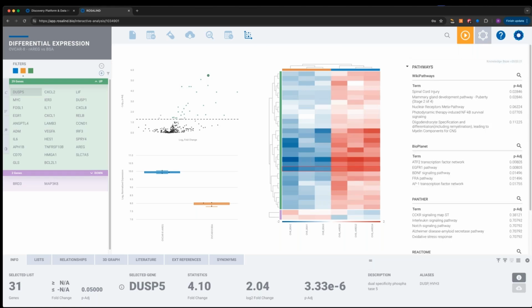And here we can access databases such as WikiPathways, BioPlanet, PANTHER, Reactome. You may have heard of these before. And before I go into this, let's take a step back and think about the experiment we're looking at. So this is again an ovarian cancer cell line treated with amphiregulin. If you're not familiar with amphiregulin, it's actually a ligand for EGFR and the EGFR signaling pathway, that receptor.